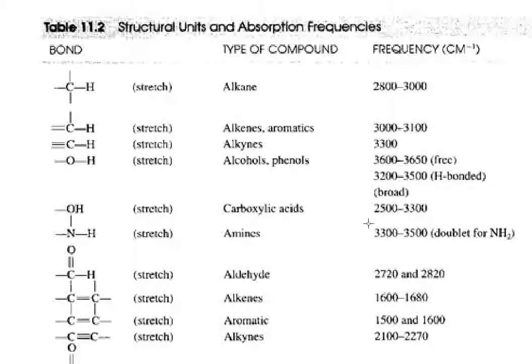The next entry in the table is an NH peak. Now an NH peak, in terms of the frequency value, is very close to the OH peak. It can vary in range from 3,300 to 3,500. Now the NH peak is also somewhat broad, but note this, that the NH peak is not as broad as an OH peak. And that's one way we can distinguish between amines and alcohols.